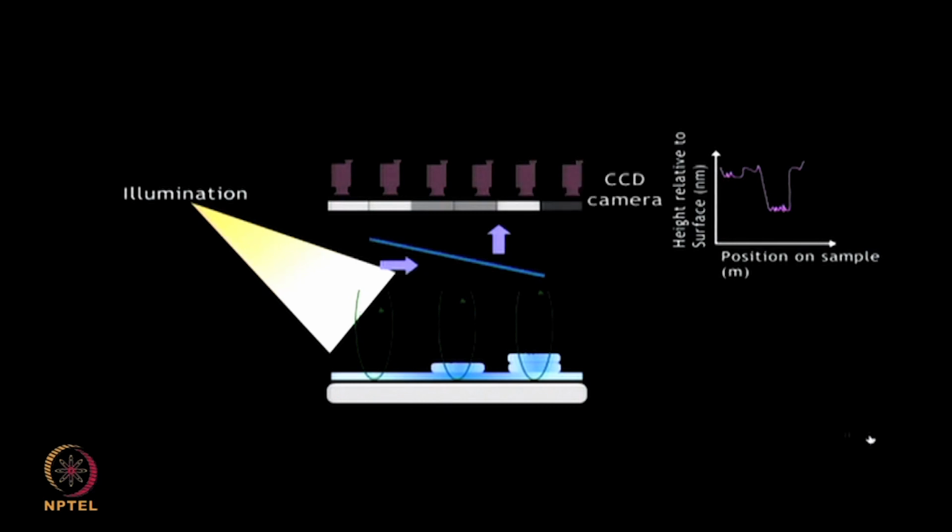Binding of the target to the immobilized biomolecule further increases the optical path difference, and it is shown as a shift in the spectral reflectivity. The spectral reflectance imaging biosensor therefore serves as a useful tool for high throughput real time detection of biomolecular interactions.